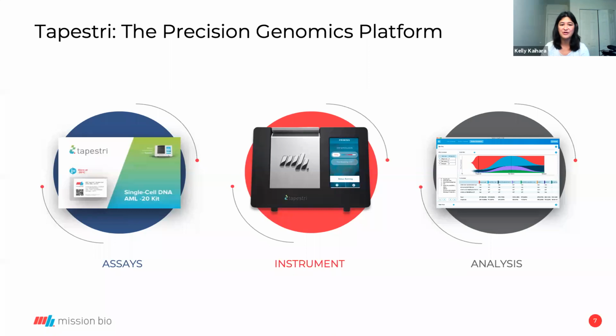So Mission Bio offers a complete end-to-end solution. We have all of the assays in order to look at DNA plus protein. We have the instrument and the microfluidic chips in order to accomplish the ability to put cells and droplets in a high throughput fashion and get to the DNA and the protein signature for thousands of individual cells. And again, we've worked really hard, and this is what most of the presentation is going to be about, which is data analysis, the really exciting graphical depiction of what is lying in your sample.